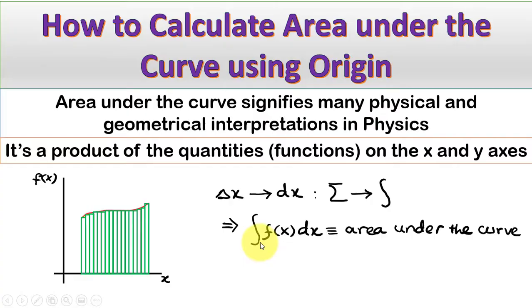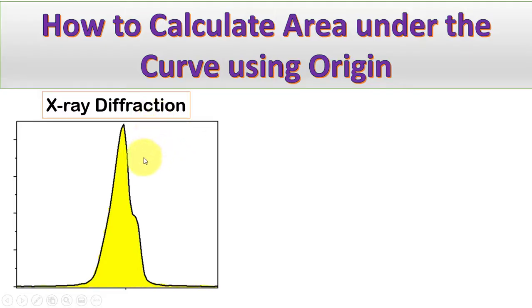When I consider X-ray diffraction, and I am having this curve, and I want to find out the area under this curve. As I know, the height in XRD and the width in XRD are having their own importances. So the area is having the composite information about the crystalline state of the sample.